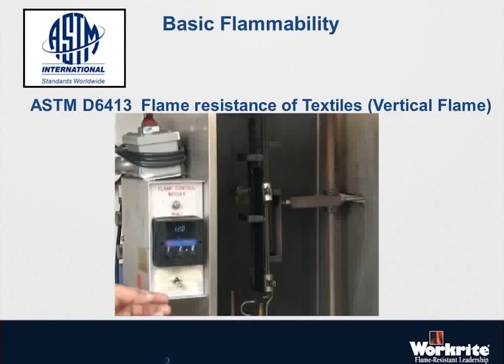All right, going to get my video to work here. Here we go. Click on the test and you can see there's a fabric swatch and a little flame at the base that's going to burn for 12 seconds. At the end of 12 seconds, the flame goes out, and that's the flammability testing.